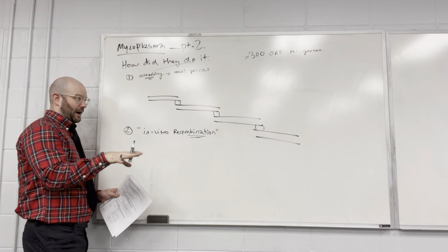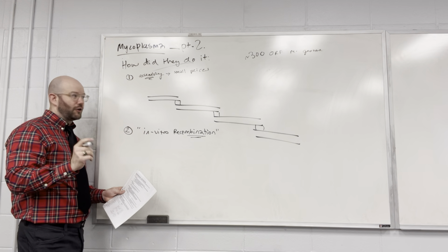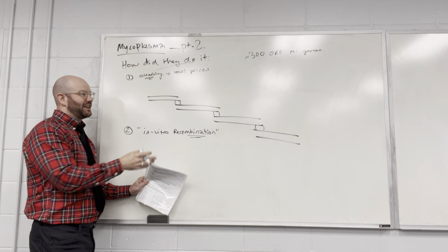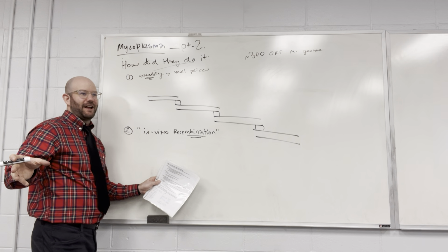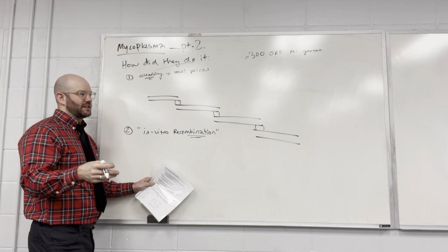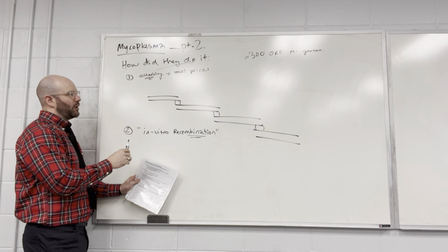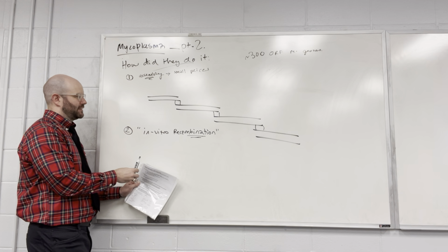Sticky ends is correct. How do they generate the sticky ends? The restriction enzyme? No, they don't use a restriction enzyme. That's the whole point of this paper: you cannot use restriction enzymes to assemble giant pieces of DNA. Because as you get bigger and bigger pieces of DNA, those sites are bound to be in there, and so you start cutting them up. They do use some restriction enzymes in certain contexts, which we'll talk about. But the whole point is you can't use restriction enzyme cloning to do things like this.